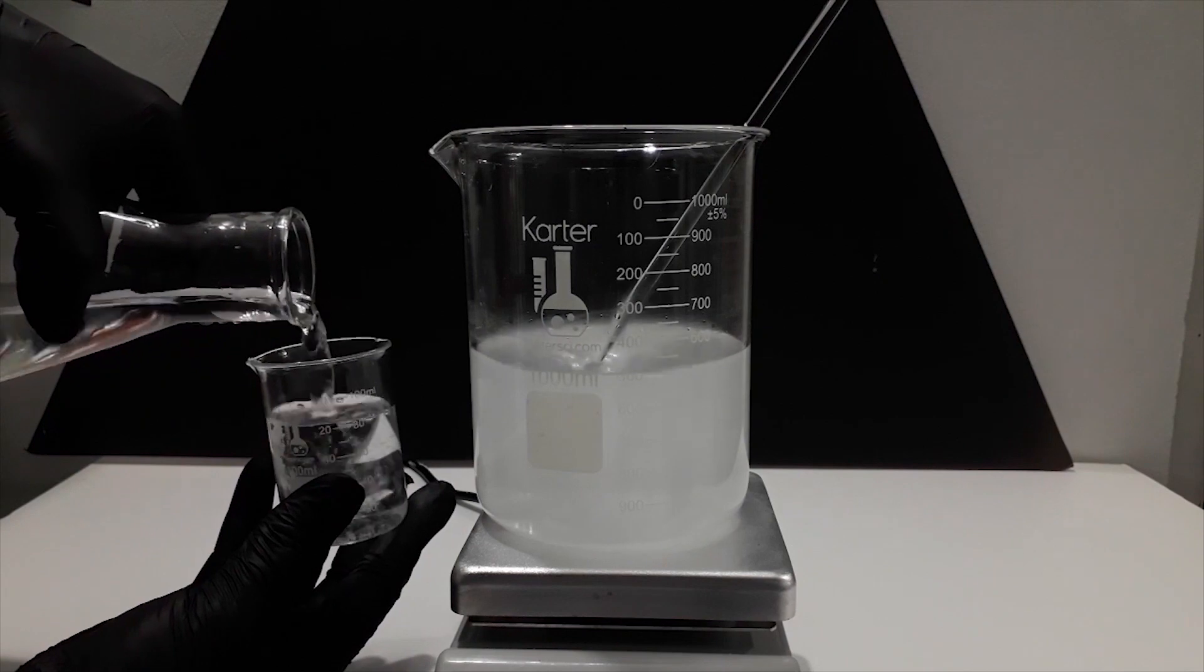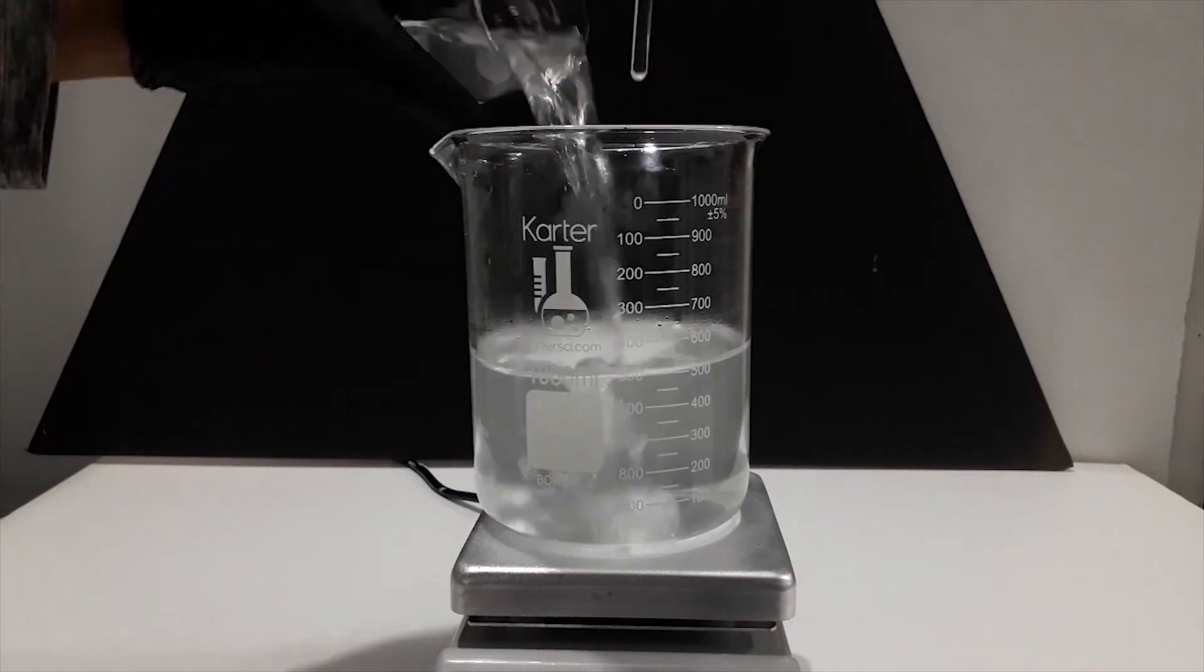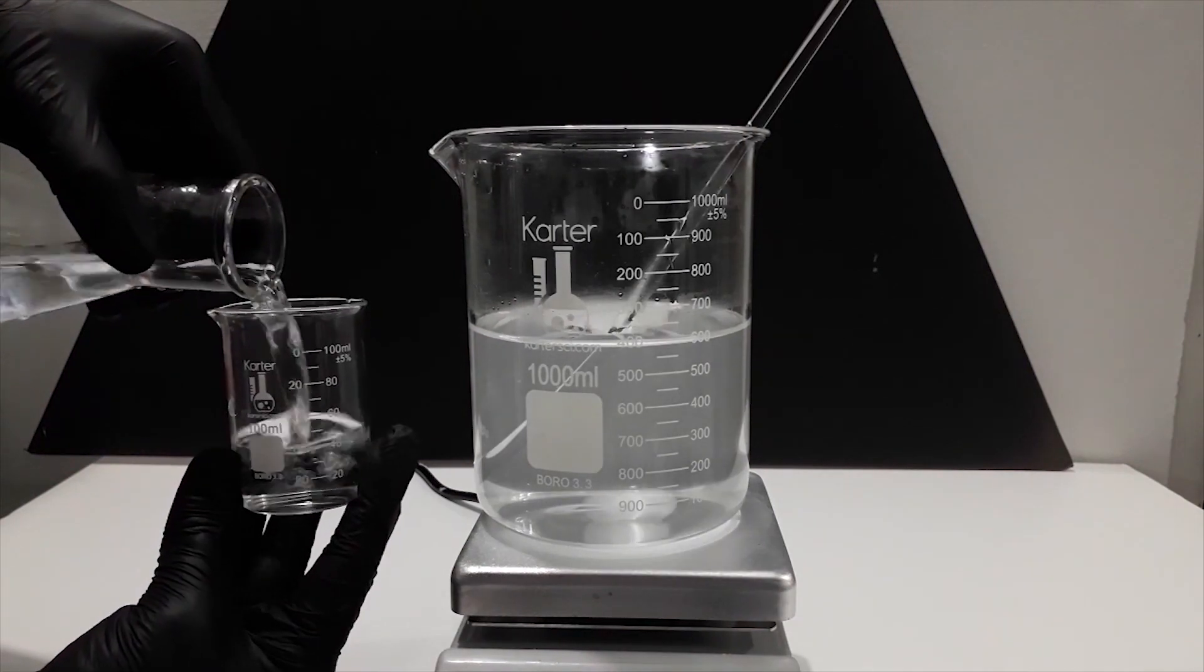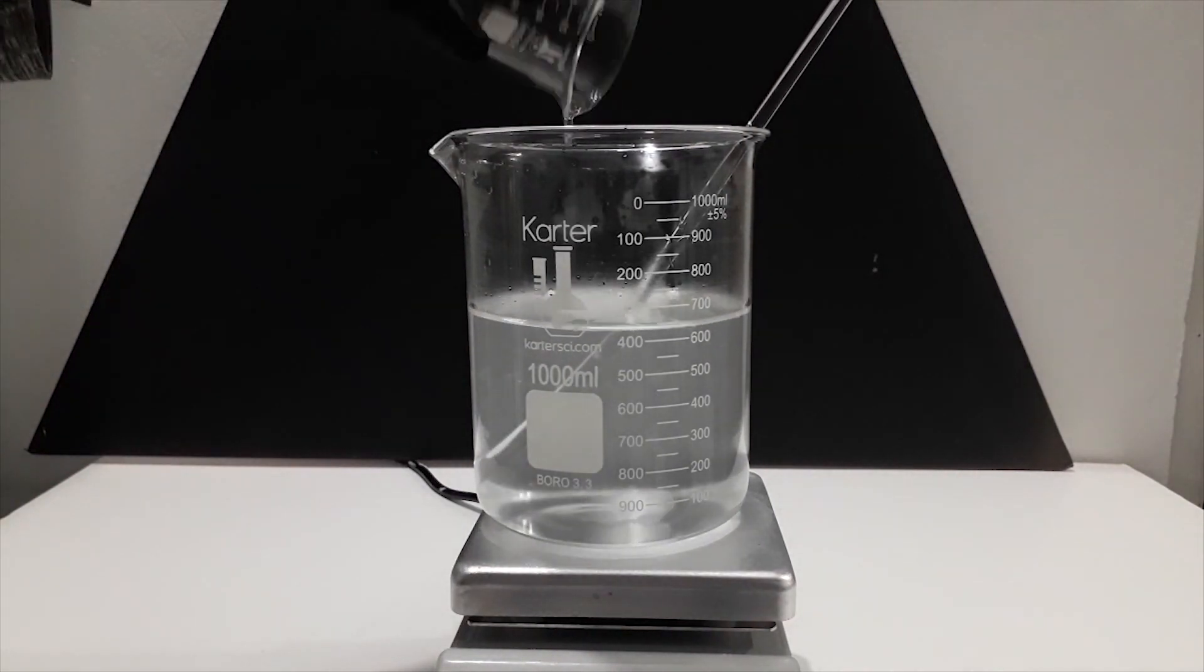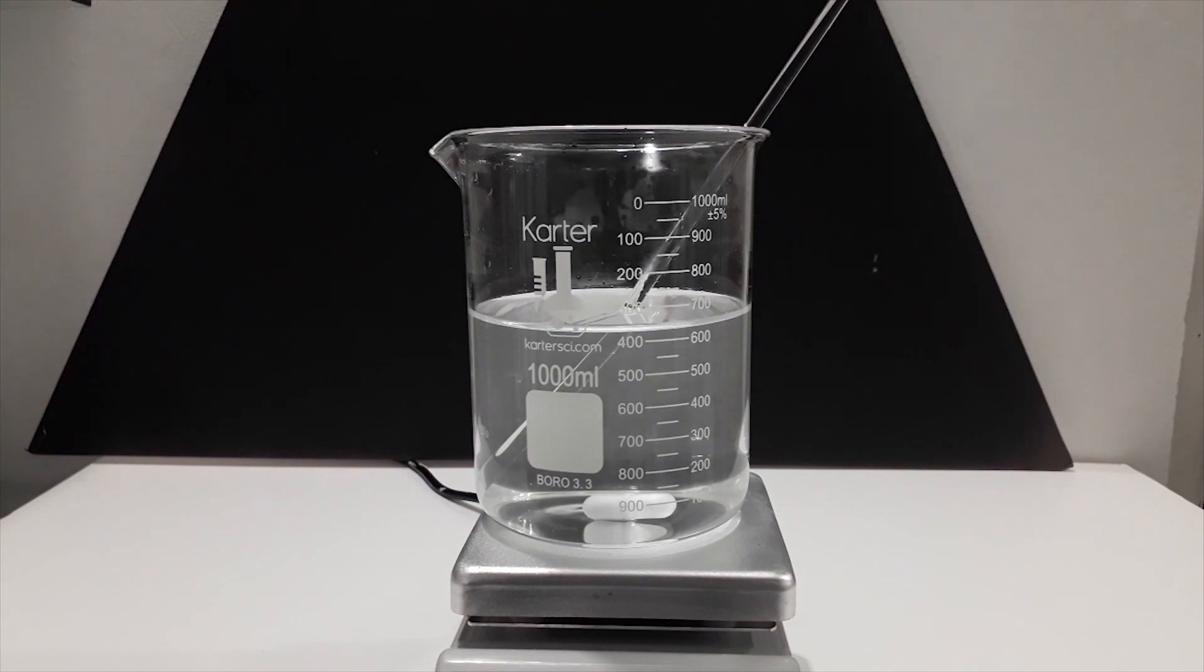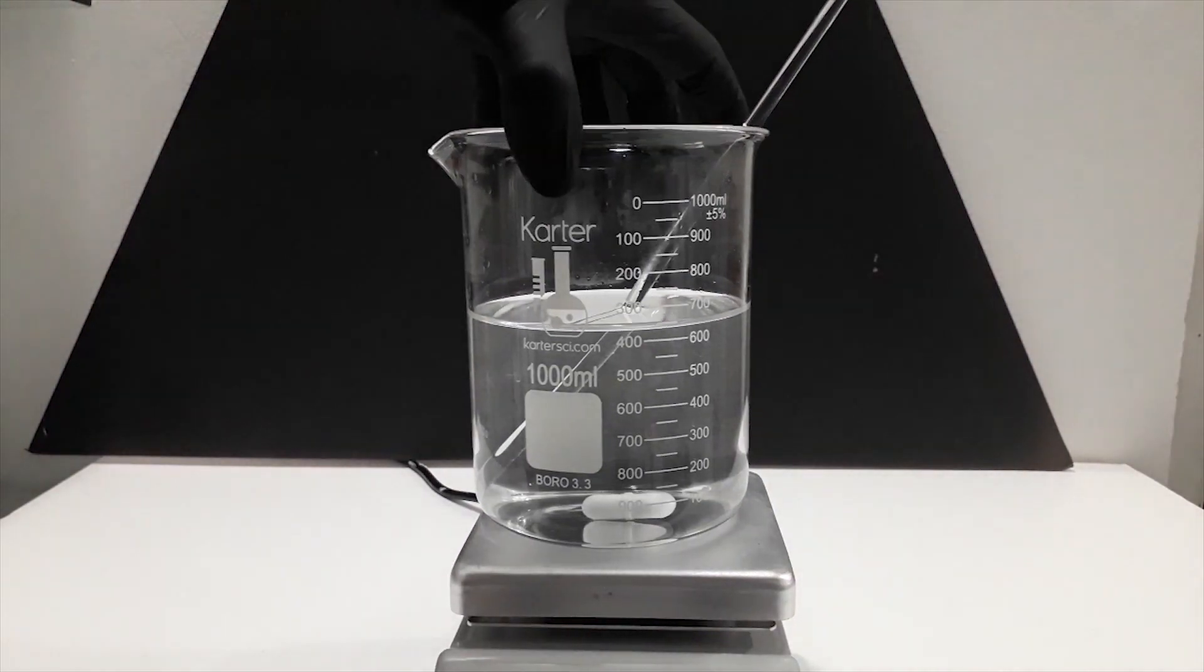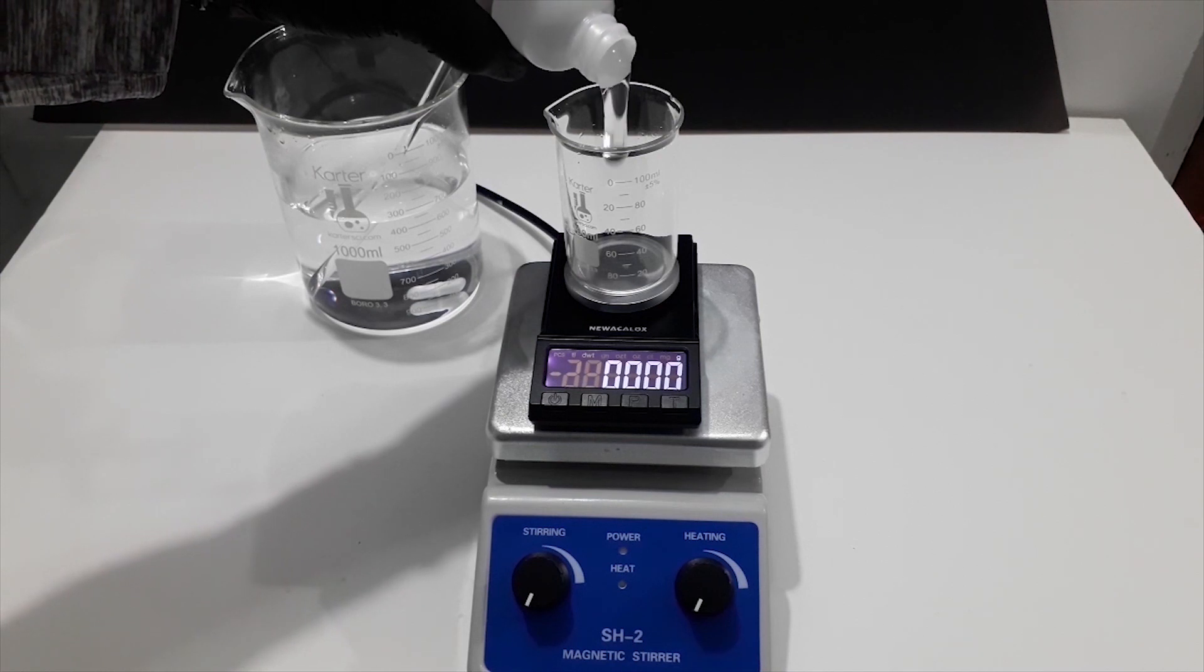A glass rod was used to prevent it from sticking to the bottom of the beaker. The small beaker was then rinsed a few times to get the remaining sodium hydroxide out of it.